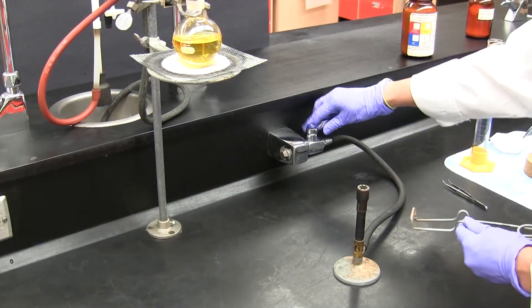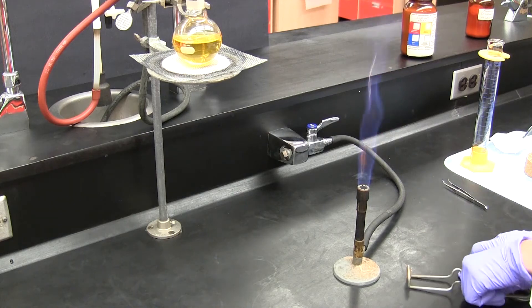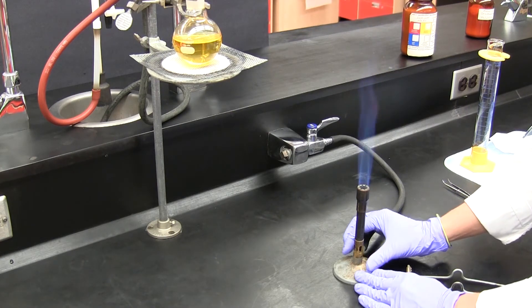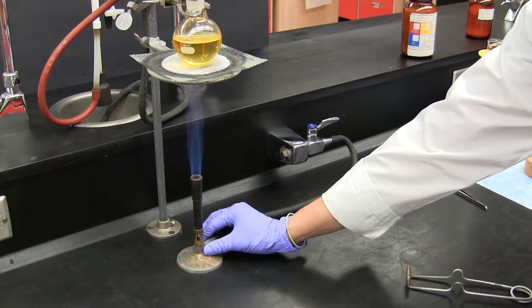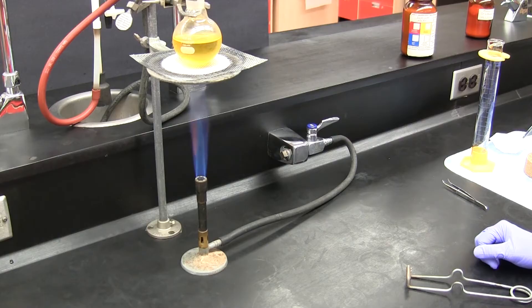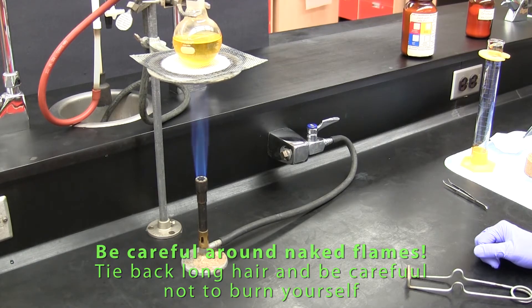Here we're going to boil the reaction mixture by heating with a Bunsen flame. The solvent here is water but if we are using a flammable solvent we would be better to use another form of heating one which doesn't involve the use of a naked flame. You should always be careful when using a Bunsen burner, tie back long hair and be careful not to burn yourself.